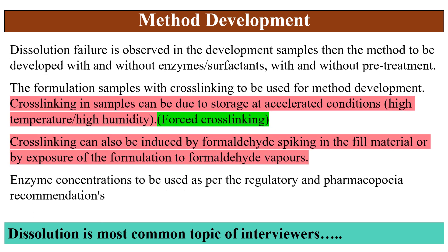Coming to method development for media containing gelatin and enzymes for products with gelatin capsules or gelatin protein: if dissolution failure is observed in development or stability samples, a method should be developed with and without enzymes or surfactant, with and without pre-treatment. This method should include justification for why enzymes are being used. Crosslinked formulation samples should be used for method development. Crosslinking in samples can be induced by storage at accelerated conditions — high temperature and high humidity — as forced crosslinking. Stability samples showing crosslinking can also be used for method development.